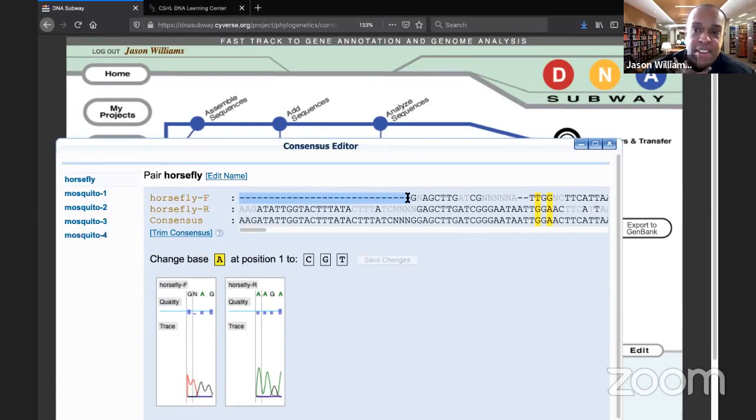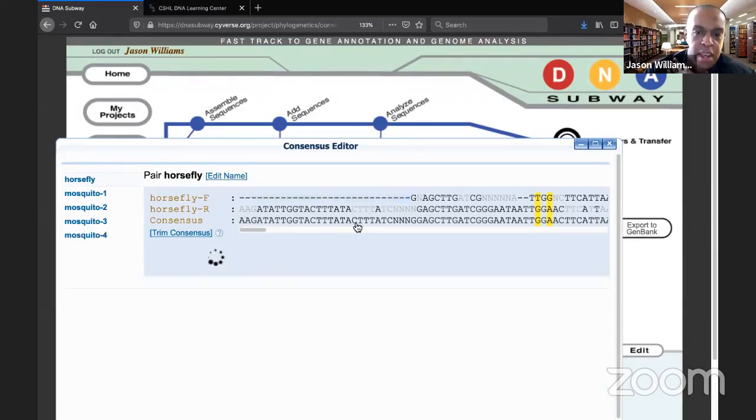Or they actually represent mutations. And that'll be more important next week, where you have an insertion or deletion of actual nucleotides. That's called an indel.